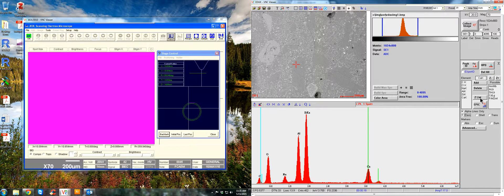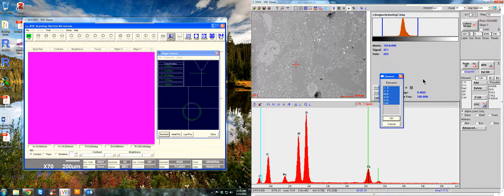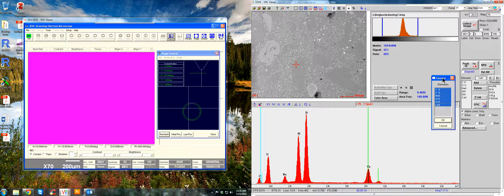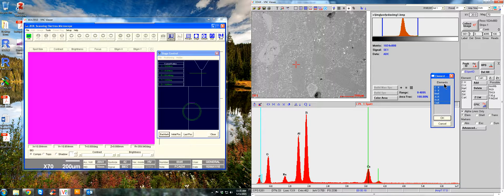Now you can look at your Z-list, which is right here. You need to choose the elements for your Z-list in order to calculate the atomic percent and the weight percent of each of these elements.